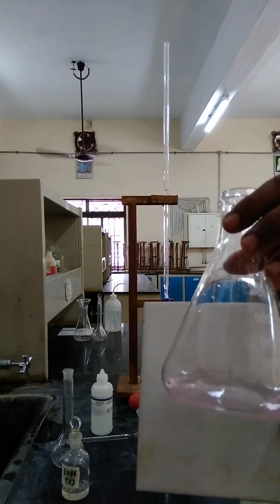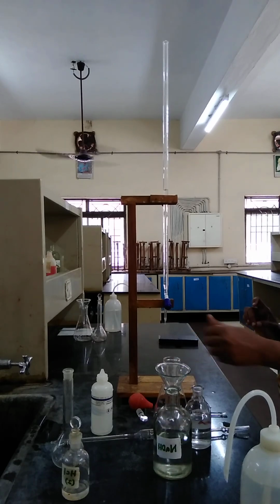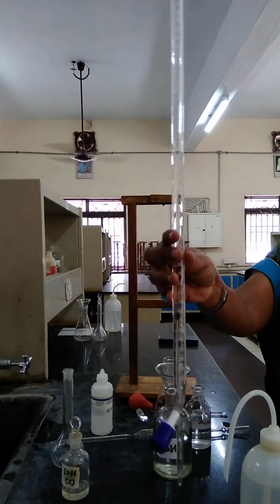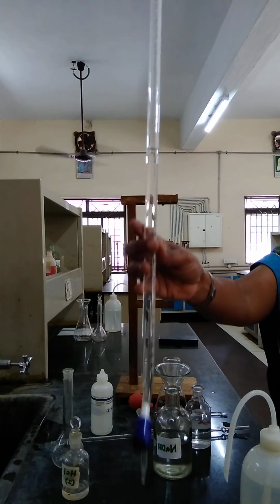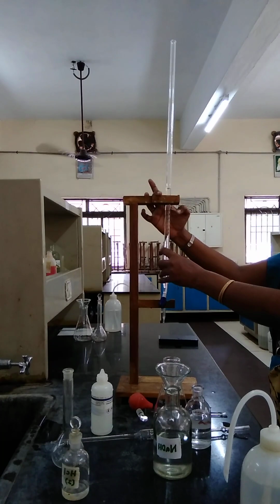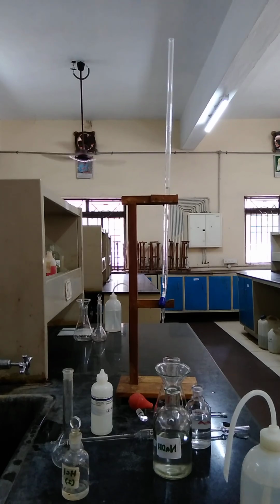Now you can see the pink. You got the permanent pink. Now you see the burette reading, it's also 25.5. So it's showing very clearly you got the concordant value, right? Lower meniscus 25.5, both titrations gave the concordant reading, so you note down the reading of 25.5. Then you can do the calculation.